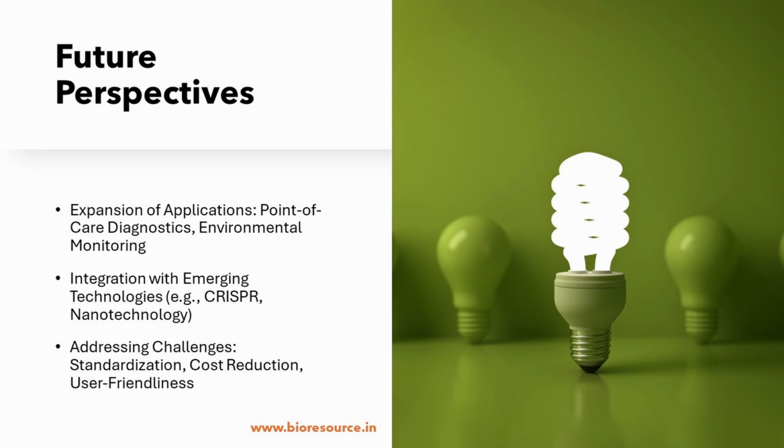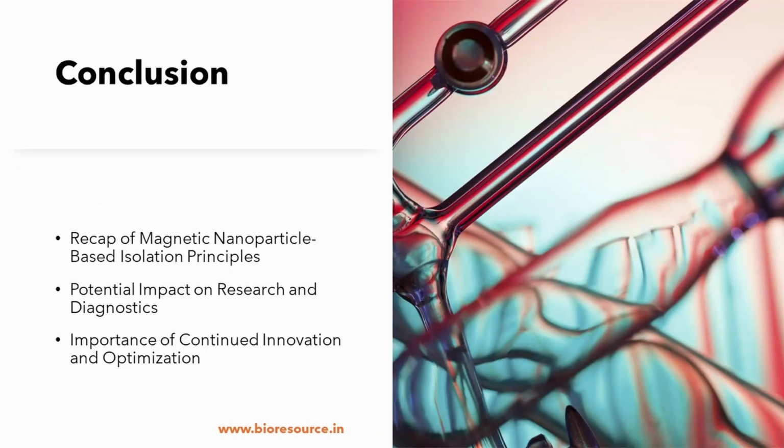efficient nucleic acid isolation. So overall, the magnetic nanoparticle based isolation has emerged as a powerful technique for isolating nucleic acids, both DNA and RNA, from a variety of biological samples, and this approach offers a faster, more efficient and versatile alternative to the traditional methods.